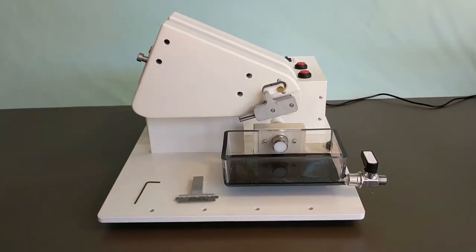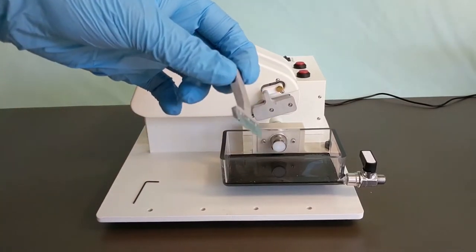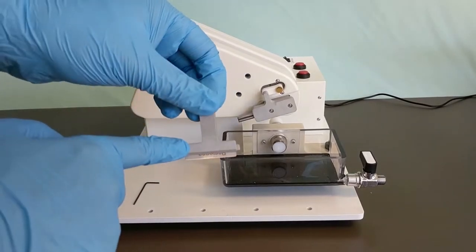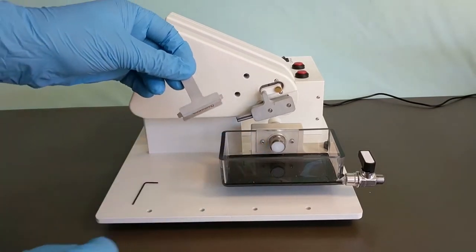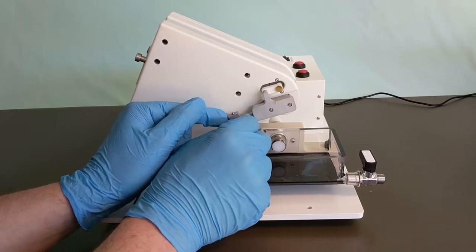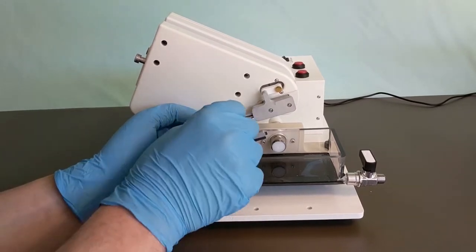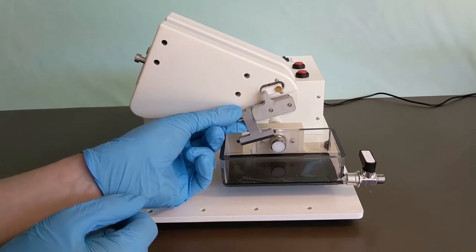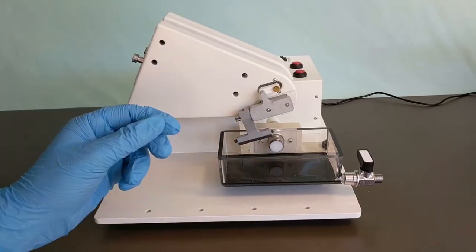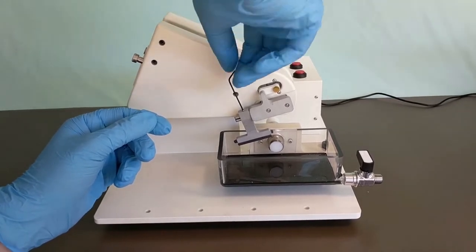The blade holder attaches here. The side with the blade edge should be facing internally towards the tube. Make sure to push the blade holder all the way onto the machine. Using the included small allen wrench, tighten the screw on the top of the blade holder to secure the blade holder in place during use.